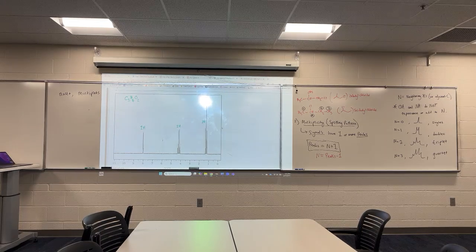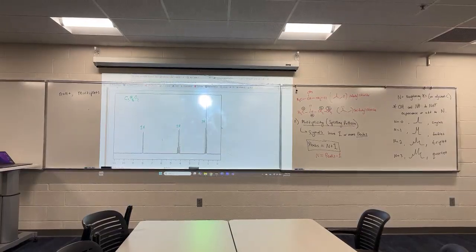You got 2 times 3 is 6. Plus 2 is 8. There's the 2 chicken rule. You've got to add twice. You multiply by 2. You add 2. The only thing you don't do is subtract by 2.